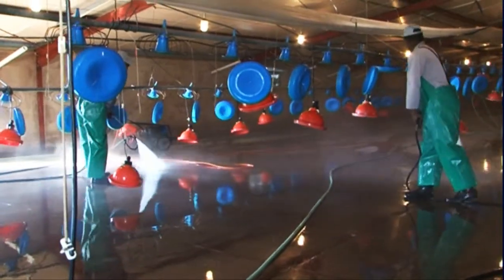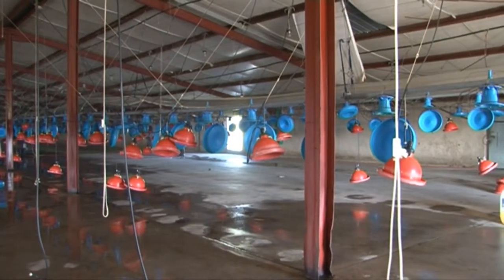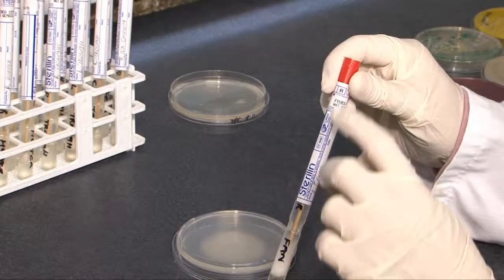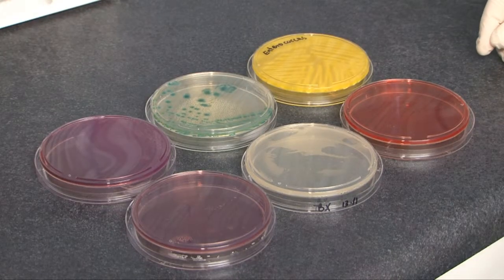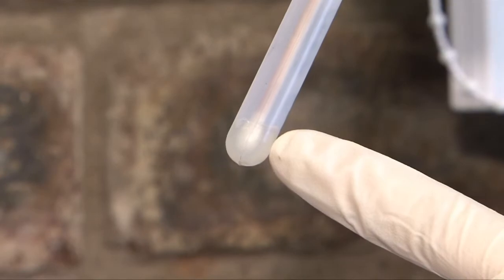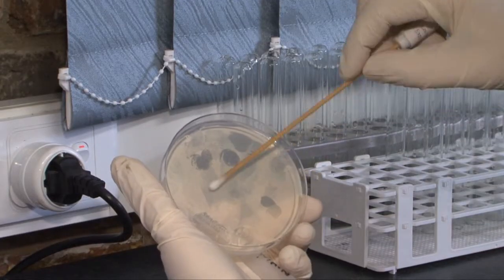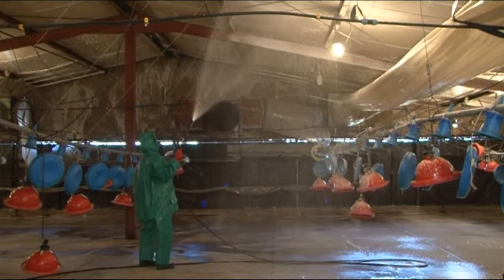How are you measuring the effectiveness of your hygiene program? There are a variety of sampling techniques which would include swabs, contact plates or exposure sediment plates. However, swabs are the preferred method you can use to measure and check the effectiveness of your cleaning, disinfecting or sanitizing program.